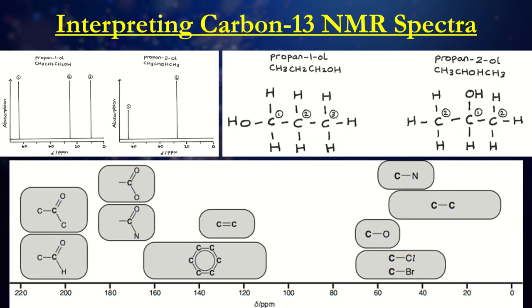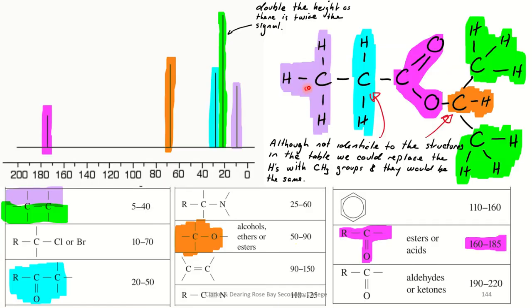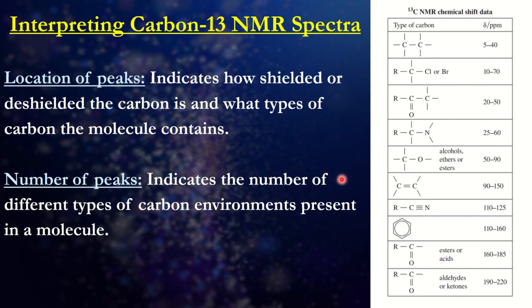All right, and then we go to the carbon-13. So exact same idea. You can use the values from the data sheet that will tell you the different structures. Remember, this is given to you in your data sheet, so all you need to do is reference the graph and then reference this chart to help you indicate the structure of your particular atom.